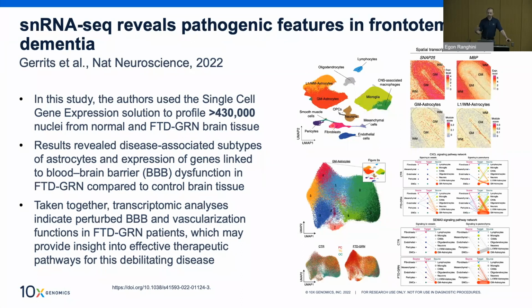And so this is really the type of information you can get with a single cell analysis, because now we can really look at the heterogeneity of your samples and really understand what different types of cells you have, what are their abundance, and how those cell populations change in terms of abundance, in terms of gene expression, as you analyze your samples. It can be along longitudinal studies, or if you're doing a treatment, or if you're comparing disease and control. So that kind of granularity you get with a single cell approach.